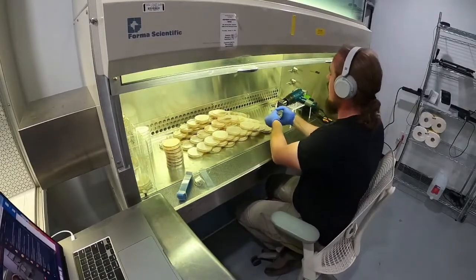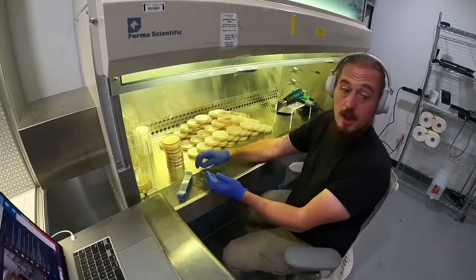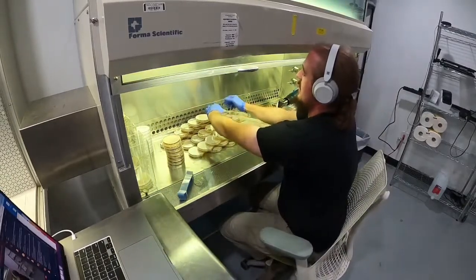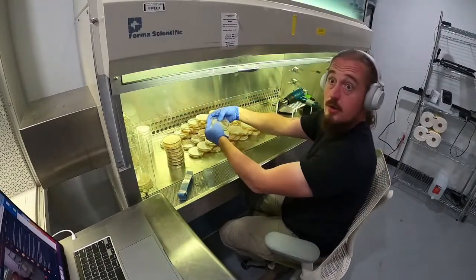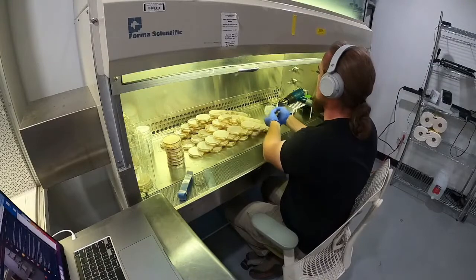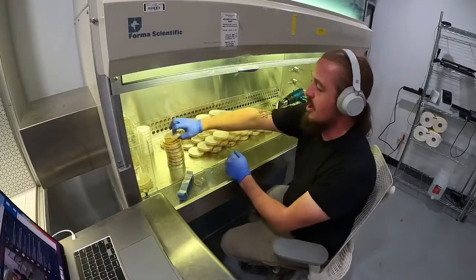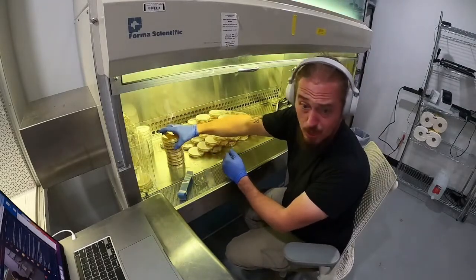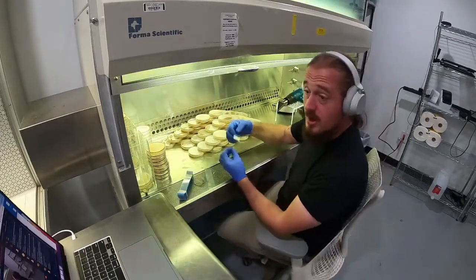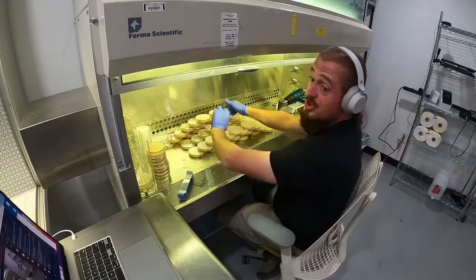And so the problem is when you inject a bunch of spores into grains, they don't understand what they're doing, right? They have to germinate, they have to worry about any contaminants, etc. When you're dealing with spores, they've got to germinate, and that germination process can take a week. It can take 2 weeks. It can take a month in some species. And so the reason you're not seeing any growth, Faro, is because you injected it with spores. Those spores are slow.